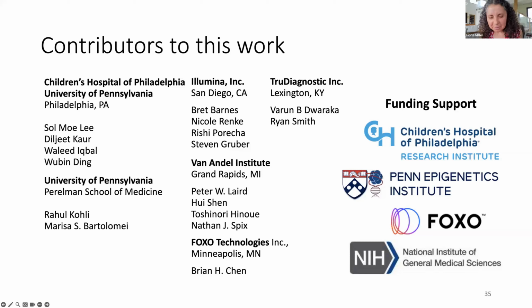Yes, thank you. And can you comment on the cost? How much is the cost to set it up and run these arrays? Yeah, the cost to set it up and run, just to acquire. So if you don't count the extraction, the DNA preparation, like bisulfite conversion, plus the array, it depends on which core you use, but the price for EPIC v2 ranges from $300 to $500 per sample.